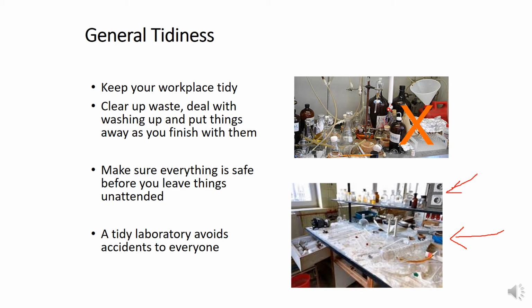If you take some chemicals from a certain position, for example on the racks, in the store, or in particular areas in the cabinets, then keep them back in that particular area. Don't leave chemicals, pipettes, tips, or whatever material you used on the working bench. This is general cleanliness and tidiness.